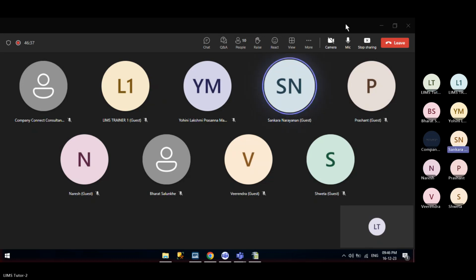At a later stage, we developed a program that passes the LIMS ID and test ID directly from LIMS to Empower without converting into the Excel sheet format. So the connectivity between LIMS and Empower was successful. Then, that later stage connectivity requires the SDK. Empower SDK.